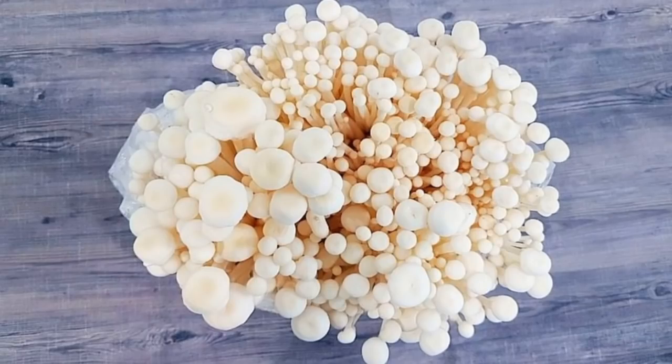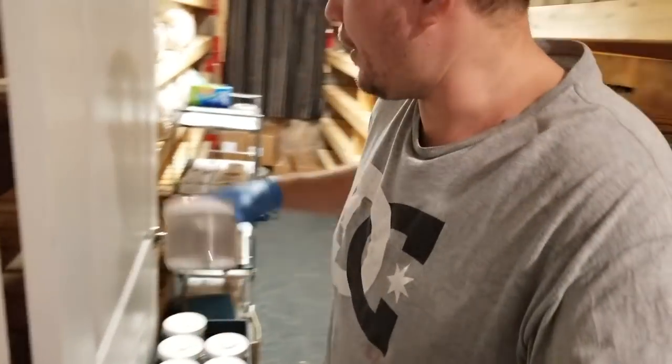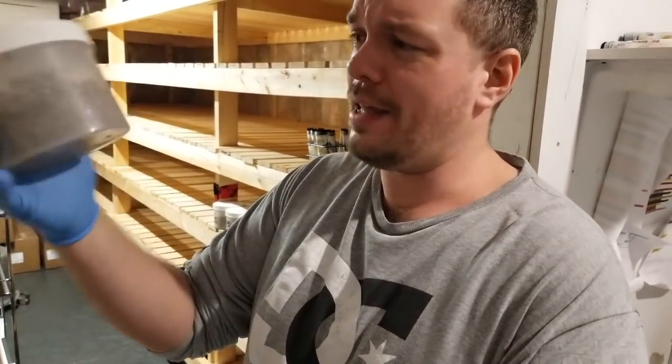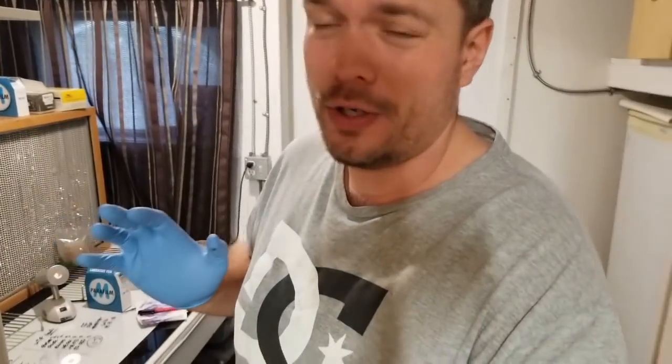So right now we're expanding our enoki and king oyster. King oyster grows a little bit slower, so I like to get that started early in the year and I usually do two waves of production. I have some jars right here and these were done on December 9th and they're just starting to colonize. I would expect king oyster to take about a month to grow, and on average I usually anticipate about three weeks for plates to grow.